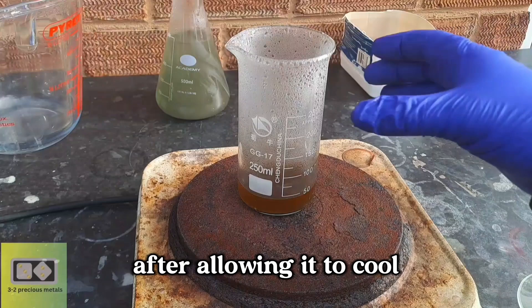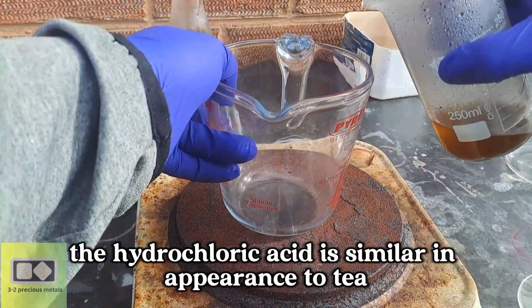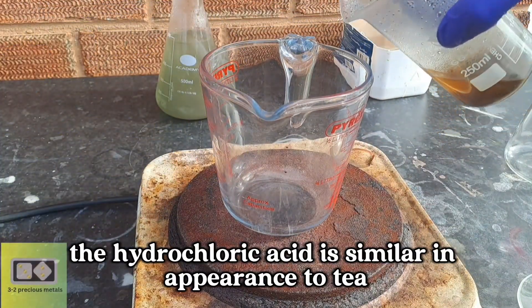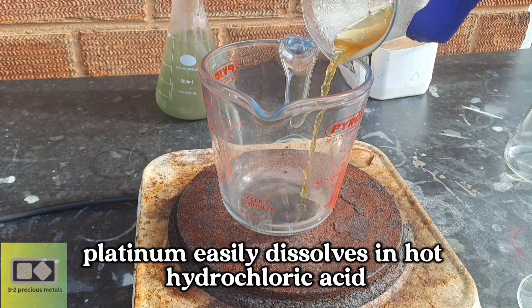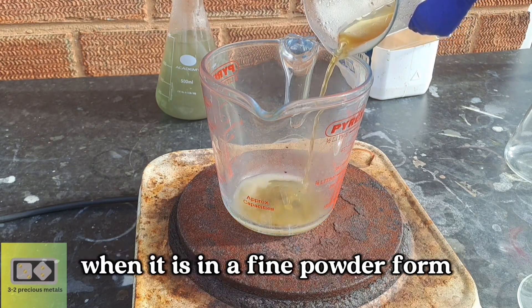After allowing it to cool, you'll notice the hydrochloric acid is similar in appearance to tea. This could be trace amounts of platinum. Platinum easily dissolves in hot hydrochloric acid when it is in a fine powder form.